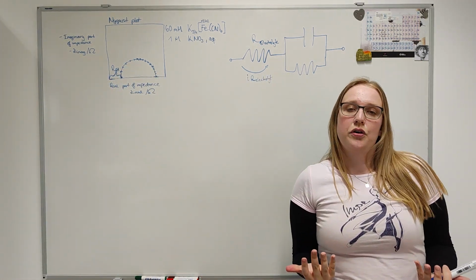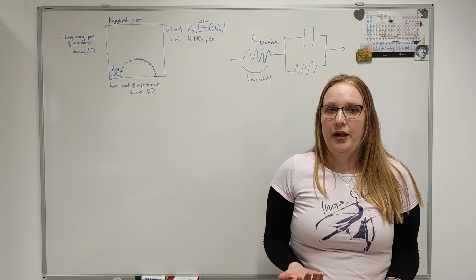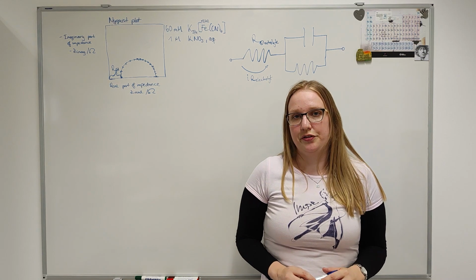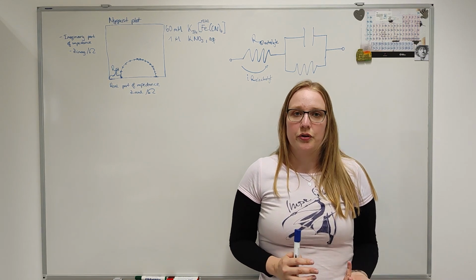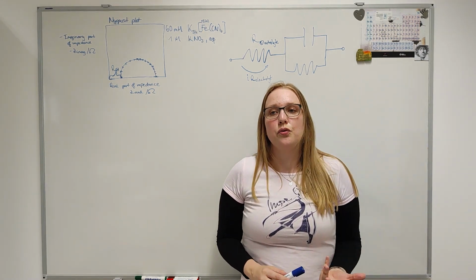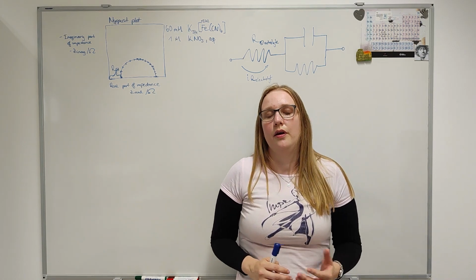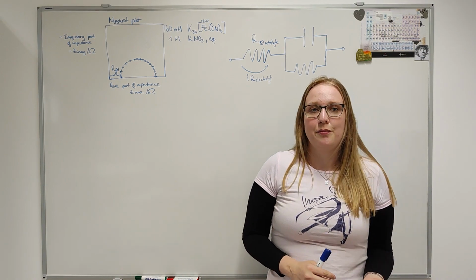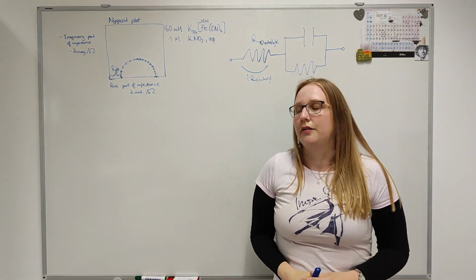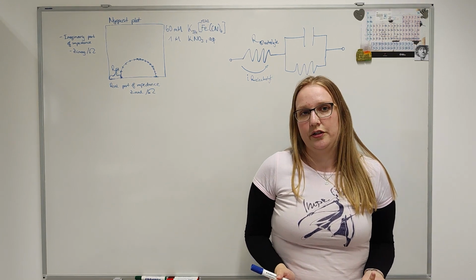This already tells us also about first uses where electrochemical impedance spectroscopy can actually be applied. For example, we might be interested in the electrolyte conductivity of an unknown system. So what we could do is have our electrochemical cell where we can measure the impedance and use certain solutions where we know the conductivity already. We could do kind of a calibration with these known solutions of known conductivity, and then measure the unknown solution and relate our measured ohmic resistance here in the high frequency part of the impedance spectrum to the electrolyte conductivity.